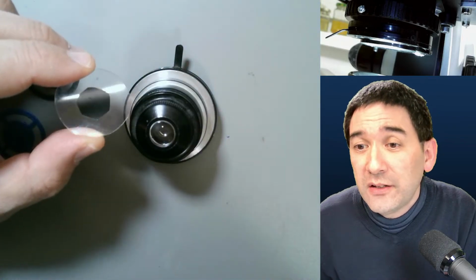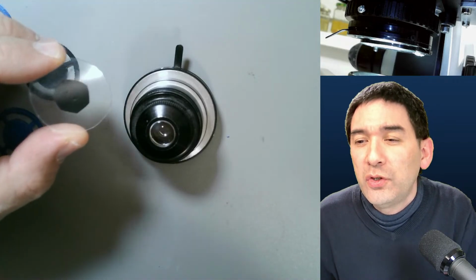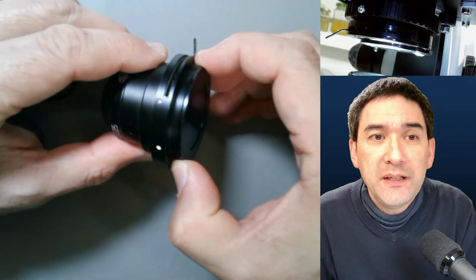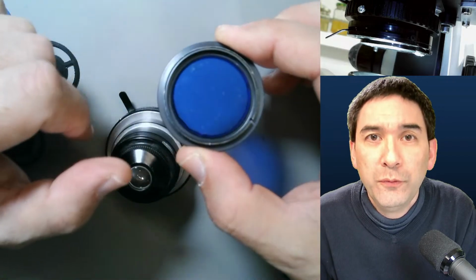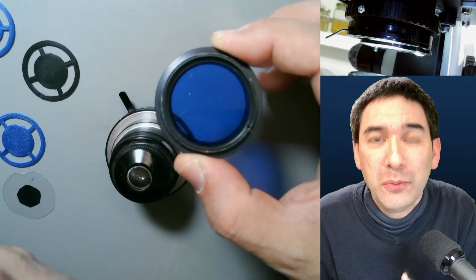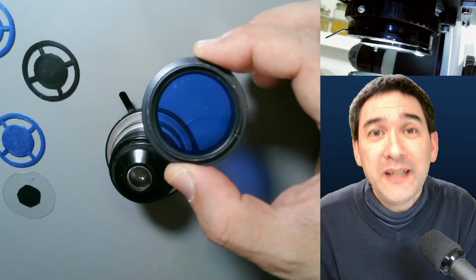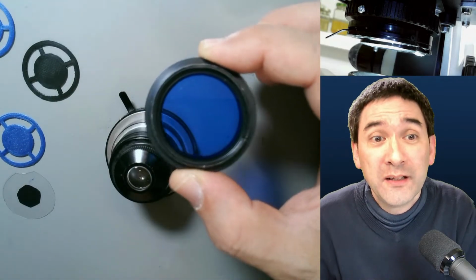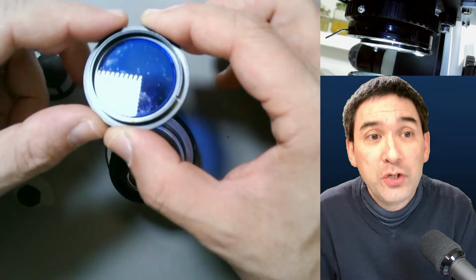Okay? And I already see that there is a question: if you place a dark field patch, do you leave the blue filter in place or do you remove the blue filter? Well, in this case, what I have here already has a built-in blue filter and it will stay in place, because this blue filter will not make the image really blue. It will simply give it a more balanced color because the red component of halogen lamps is quite strong. It simply will remove that, so the image will not look blue if you include that. So essentially, it just stays in here.